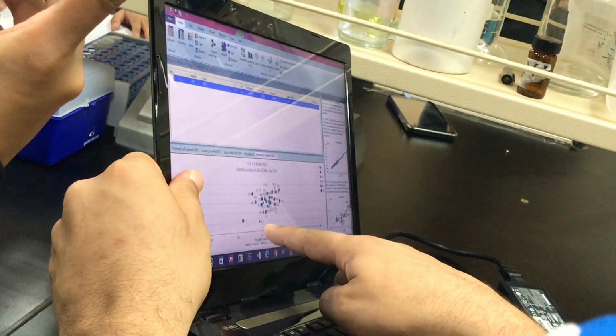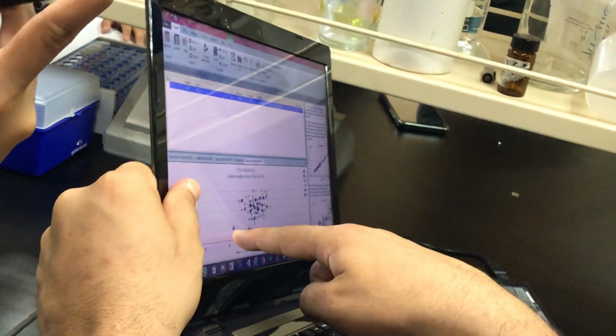I can change it, but it will be a lot. I mean, you cannot see the name. If we can change the name, if this extract gets the whole letter, what does it mean? Cannot plot. You can see 01, 02, 04. This is the group. Okay.